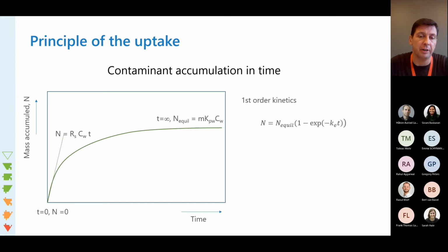within this area. In some cases, for example, when using absorption-based samplers like silicone LDPE in sediments, we can set up some tests where, for most of the compounds we're interested in, we can actually bring the concentration in the sampler to equilibrium with the concentration in the sediment. So in these cases, we can actually work at the other end of this spectrum.